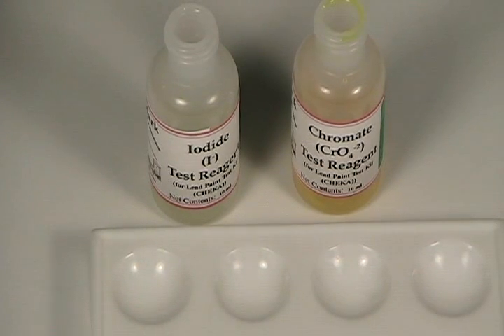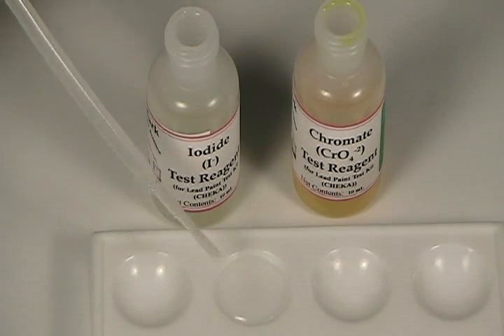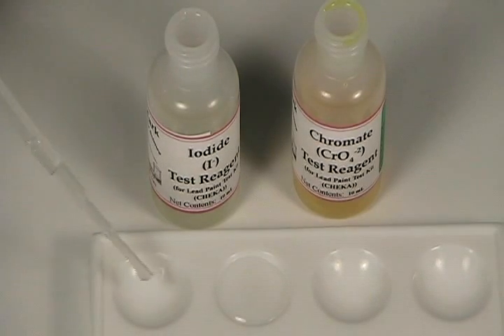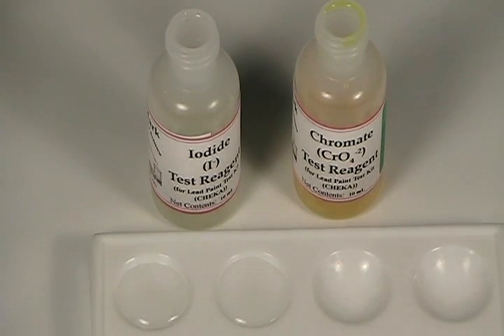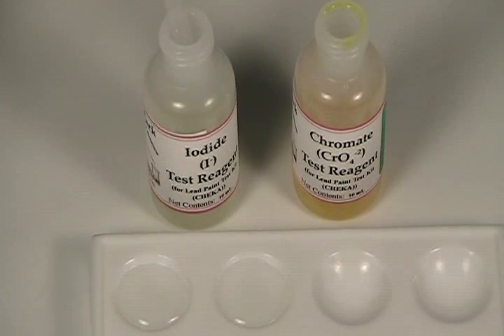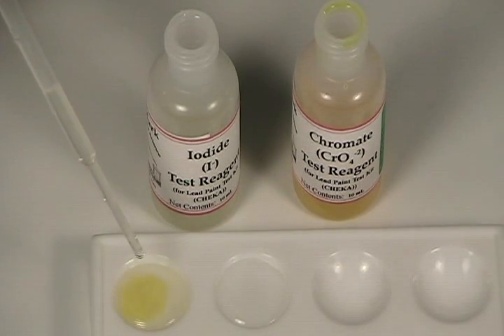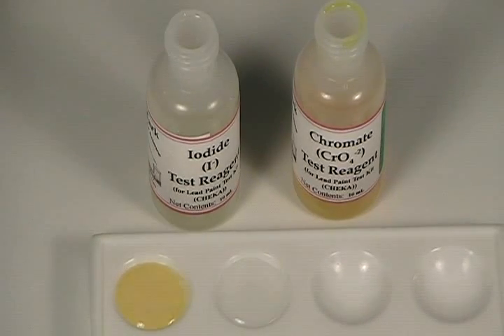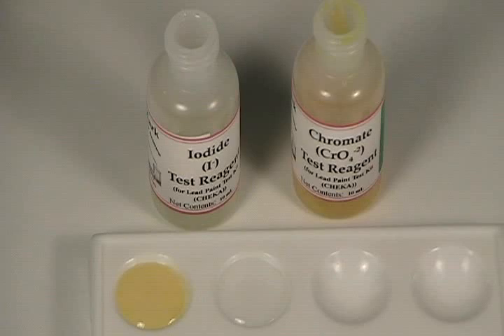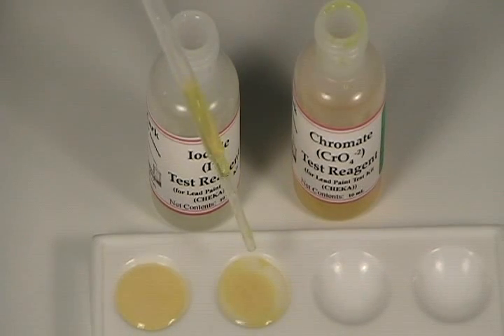So what we're going to do now is a couple of confirmatory tests. We'll place some of our paint extract in each of two wells of the reaction plate. We'll now add one or two drops of iodide test reagent. If lead is actually present, we should get an immediate yellow precipitate — and that's exactly what happens. So at this point we're about 99% sure. We're going to try another test reagent, the chromate test reagent, and again we should get a yellowish precipitate immediately — and we do. A very strong precipitate, clumping on the bottom in little granules.